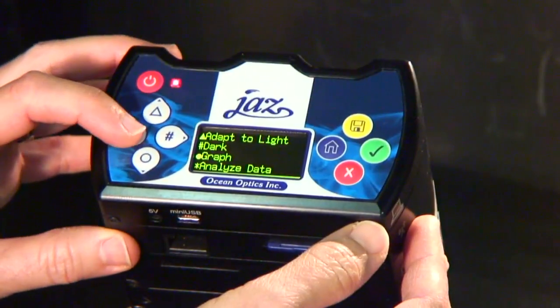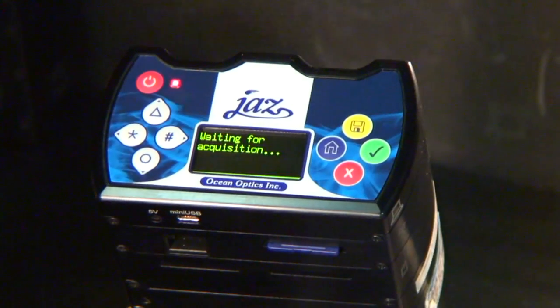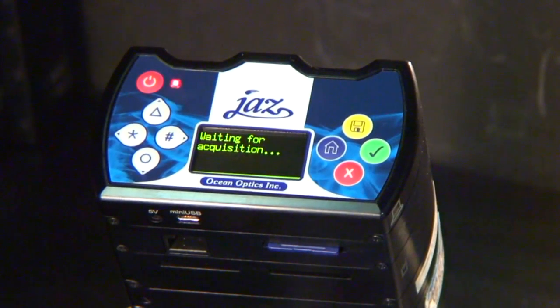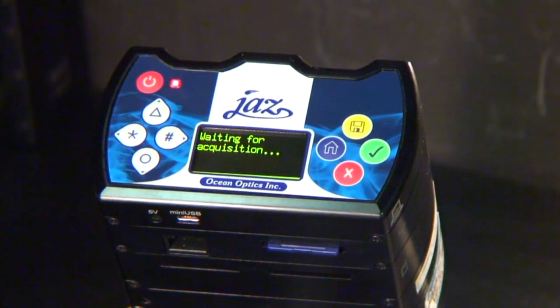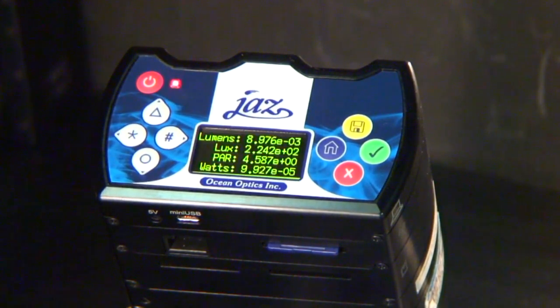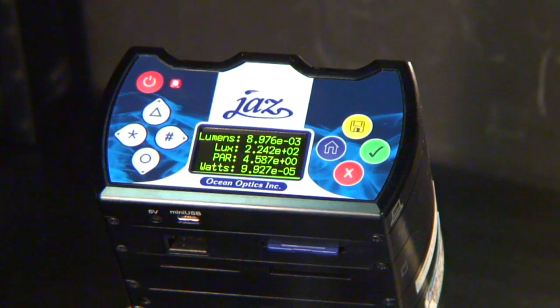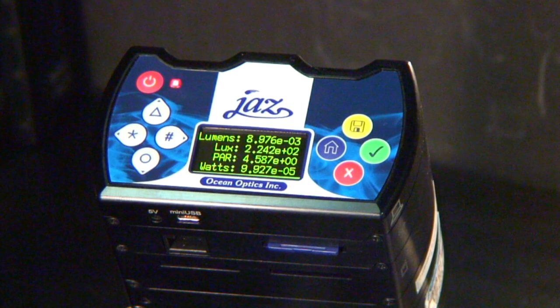In this video, we'll cover the basics of analyzing the Absolute Irradiance SD card data collected with the JAZZ Spectrometer using SpectraSuite software.